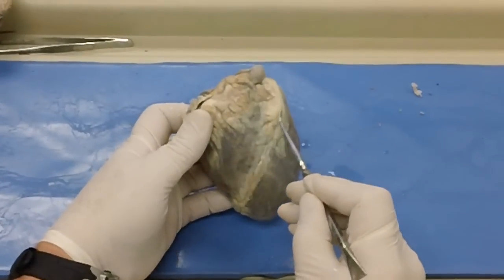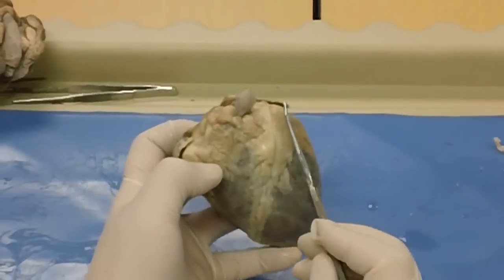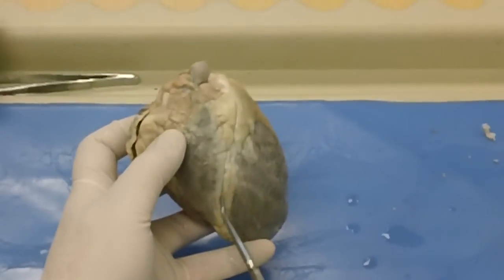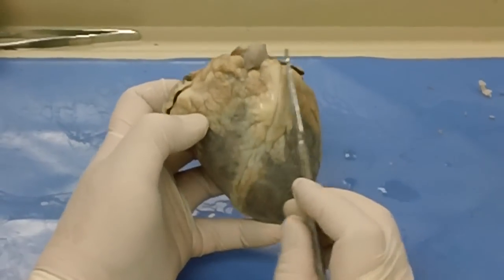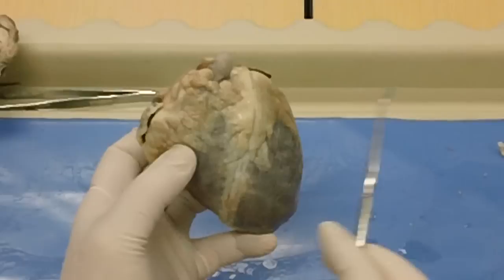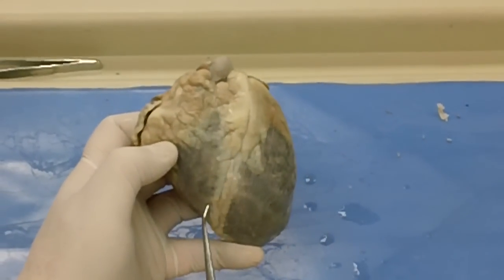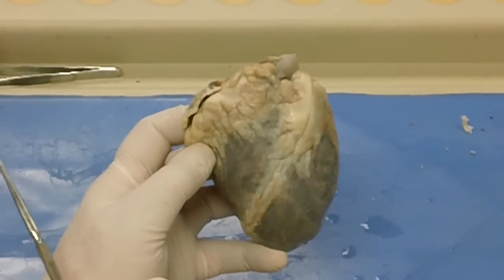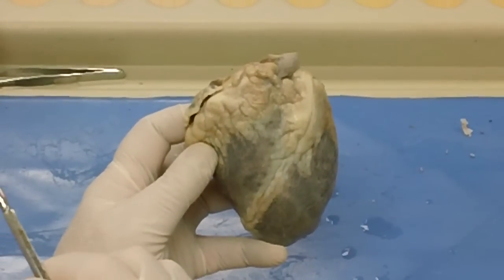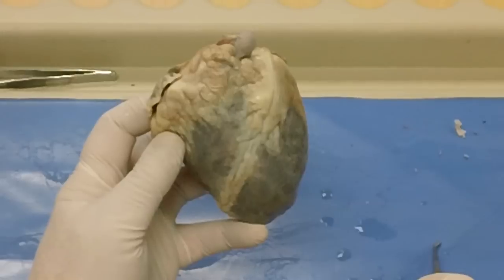This is a really important structure because it helps orient where things are. This is the paraconal interventricular groove. It should be the first thing on your list, because it lets you orient the heart. If that's the paraconal interventricular groove, that means this side of the heart is the right side, even though it's cranial in the animal. This side is the left side. Everybody see how that is?